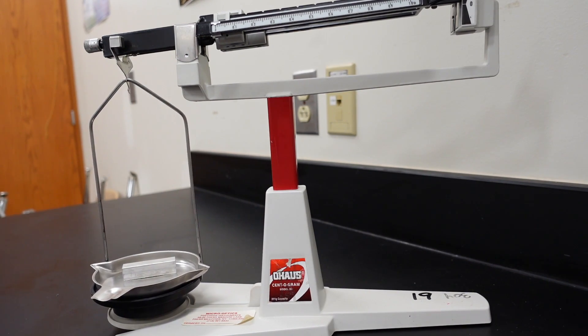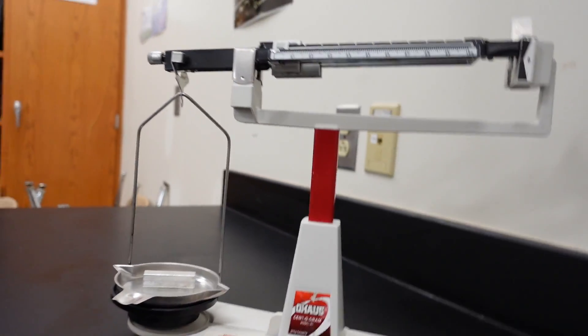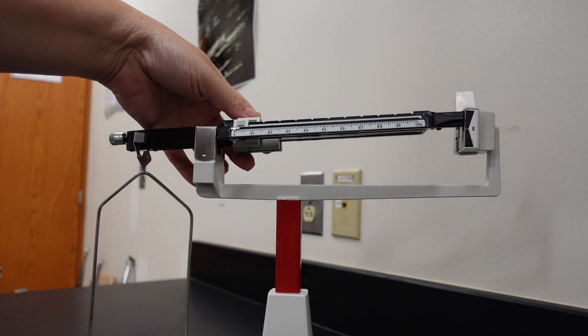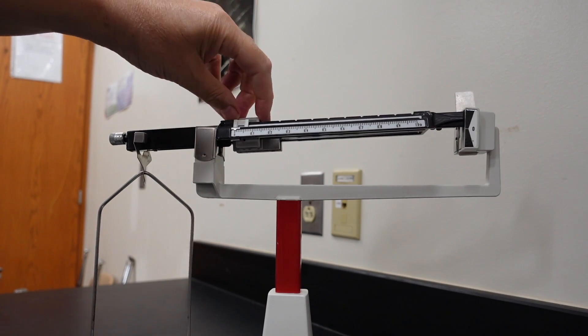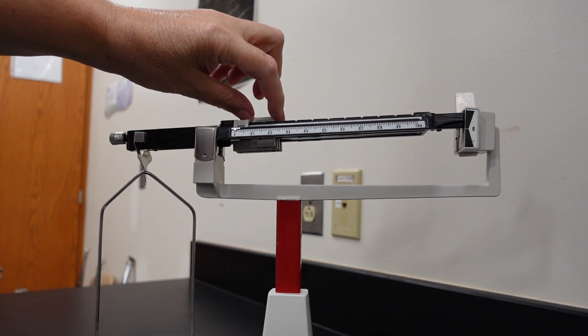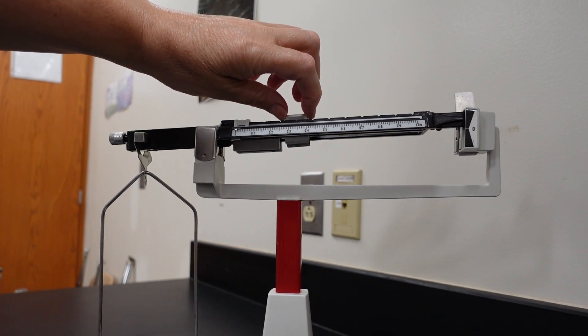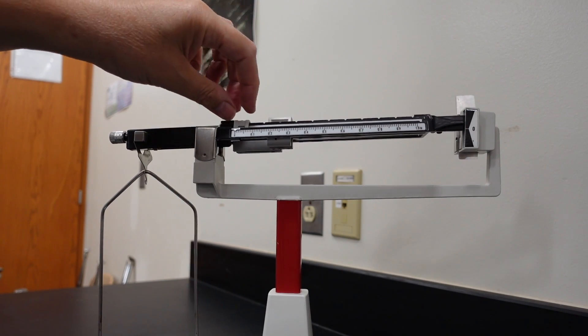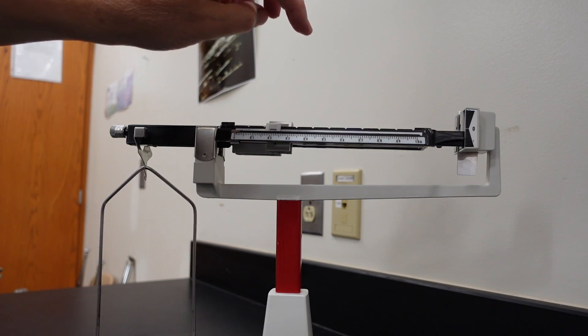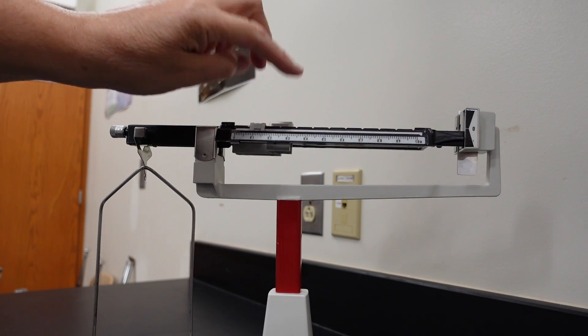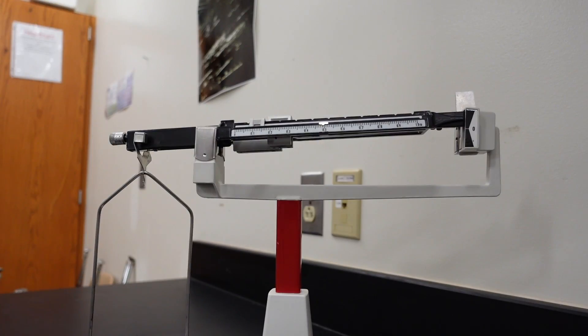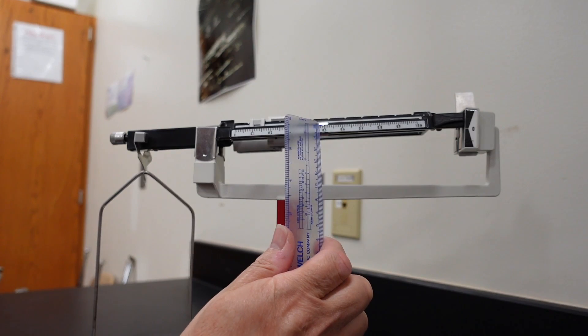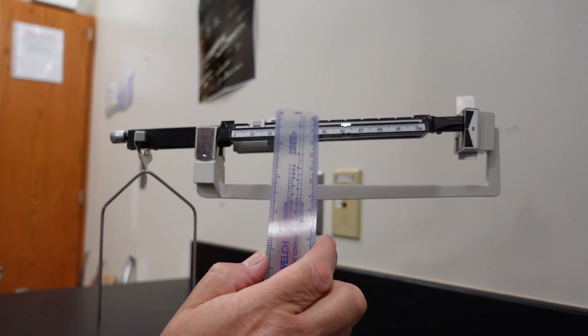So, now I can take this and place it on the beam balance. So, we move the mass riders. We will start off with moving the hundreds place. Okay. Moving the tens place. Okay. Moving the ones place. And, then moving the final place. Let's start off here. And, then I will adjust it a little bit more fine-tuned.